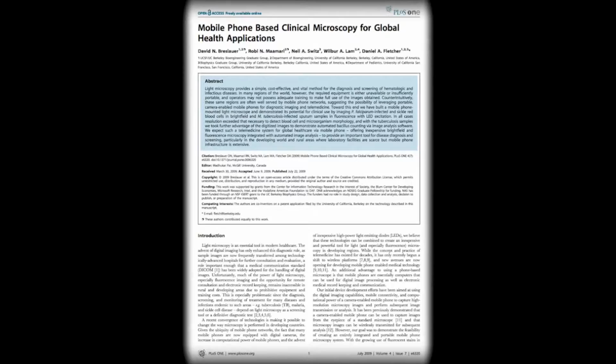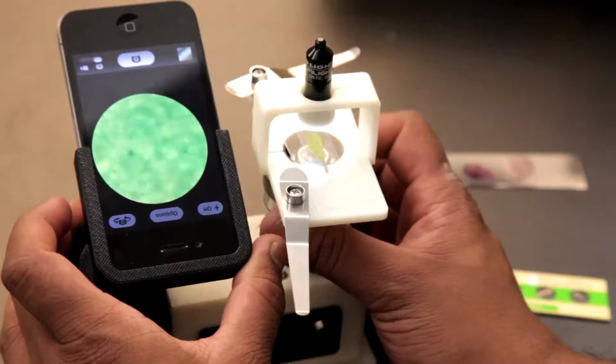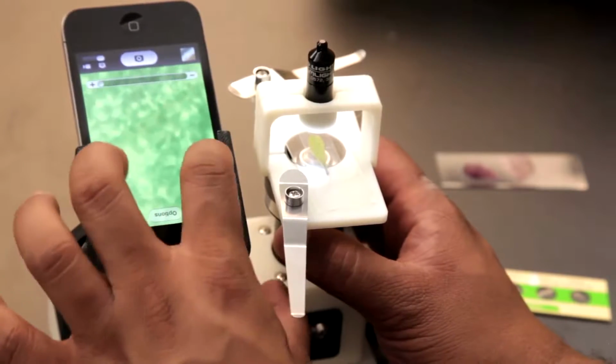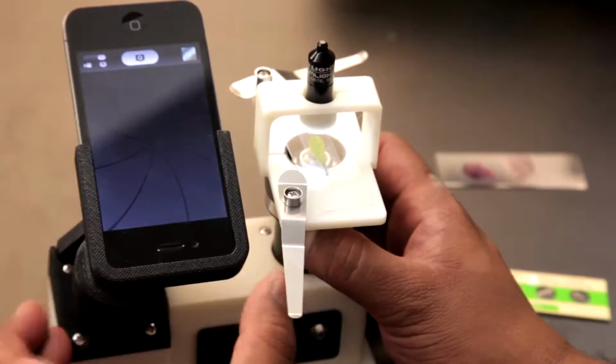I read the journal article, which was publicly available, which was very helpful. I saw what they had originally intended for it: disease detection, and to identify diseases such as malaria and tuberculosis, TB, it's imperative to get a good look at the blood and look at the blood cells.